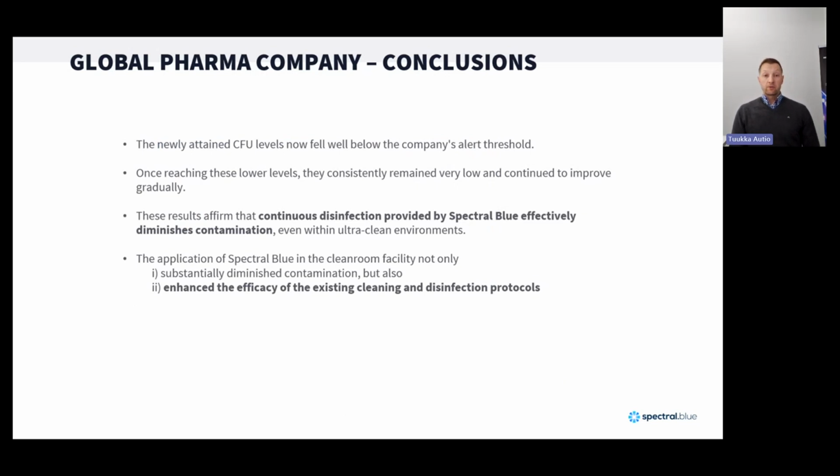So like I mentioned, the new CFU levels were really low and well below the thresholds, and they persisted, showing that the continuous disinfection provided by spectral.blue was able to diminish contamination even in this kind of ultra clean environment. Then there was speculation as to why the effect did not go away when they took out the blue lights.